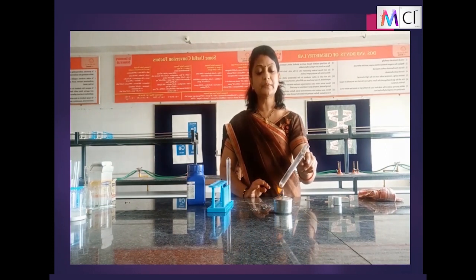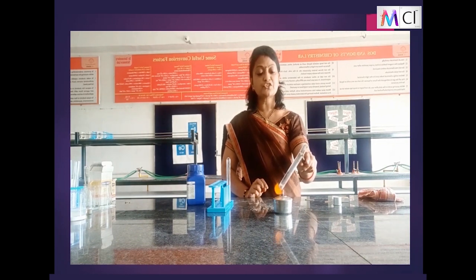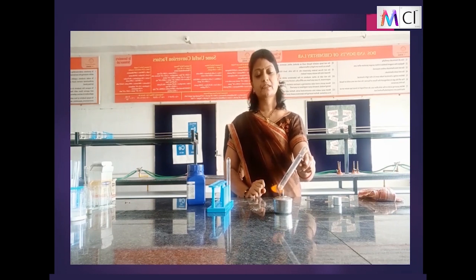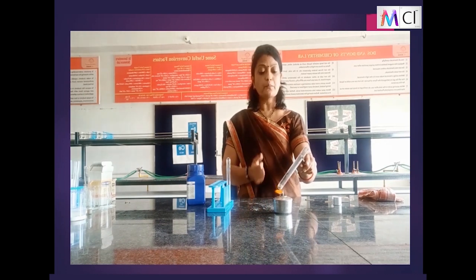Slightly the color is changing. The color is changing to reddish brown. You can say that a chemical reaction is taking place. As there is a change in the color, we have already learnt a chemical reaction is observed when there is a change in the color. So we had earlier ferrous sulfate green in color, now it is changing to brown. You can observe, children.